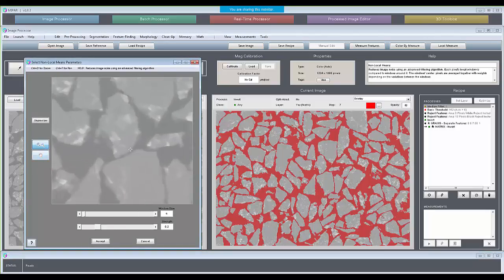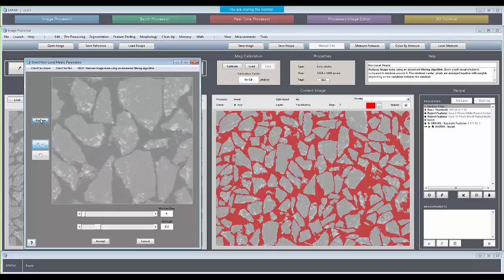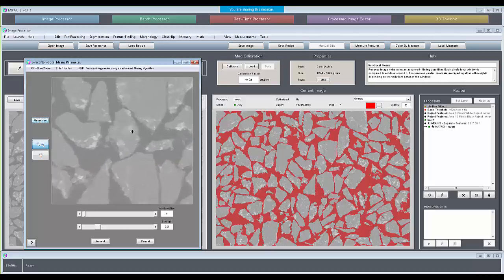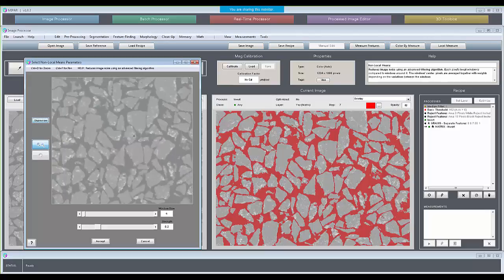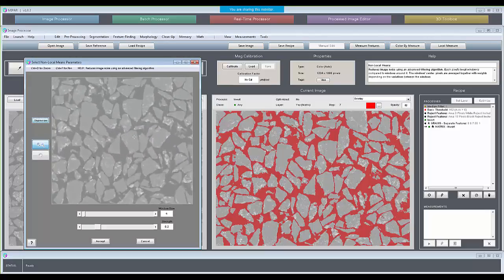And that actually took quite a bit longer than it usually does. I think the screen share is slowing it down. But this gives a very nice smoothing with minimal edge disruption. This strength here controls the amount of blurring that happens.